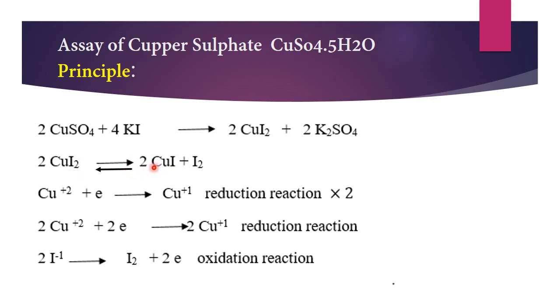Okay, and this reaction is reversible reaction، يعني ممكن انه يرجع يتكون الكبريك iodide. زين، اجي هنا التفاعل شنو اللي دا يصير ما بين البوتاسيوم ايودايد and الكبر سلفيت، وشون تحرر الايودين بالاخير.